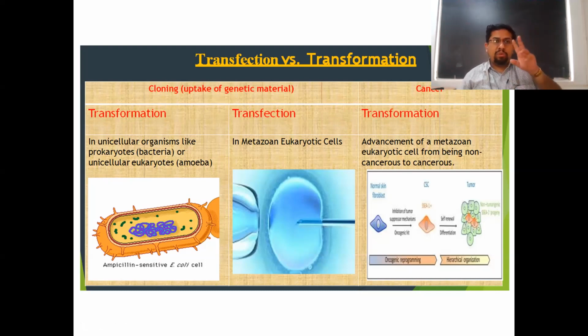There are 2 different kinds of animal cells: those which can divide continuously, which are continuous cell lines, and primary cells. You know the difference between primary and continuous cell lines, right? In animal cells, primary cells are those which are derived from a specific tissue, like epithelial tissue, or lymphocytes, or liver cells like hepatocytes. It could be neurons, different kidney cells, different ones.